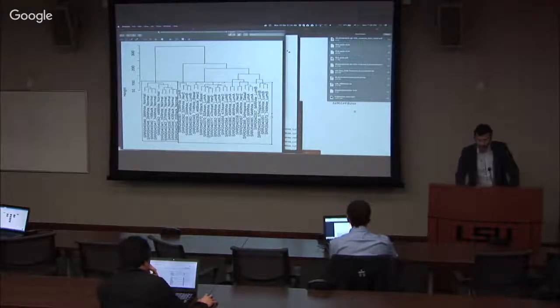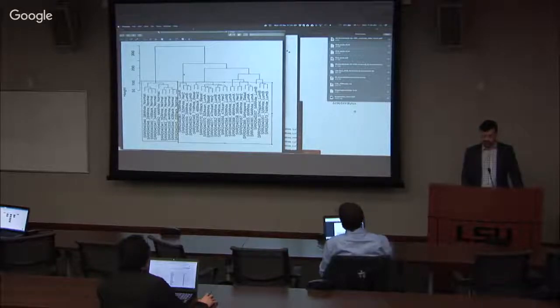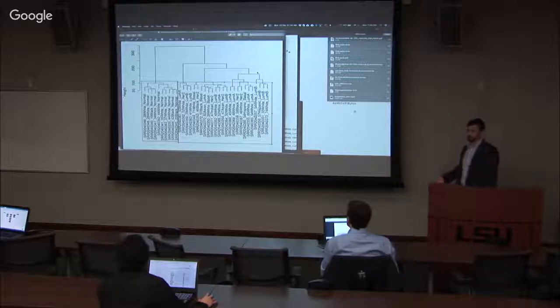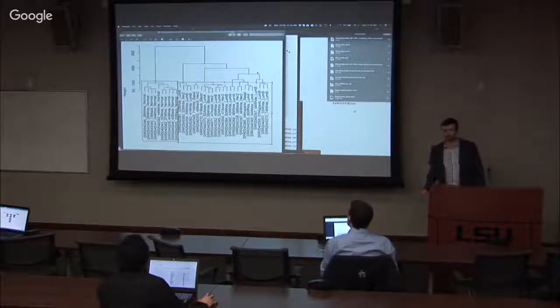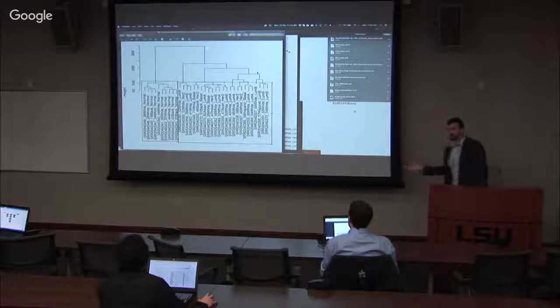But in reality, within all the rest, there's at least a number of other significant subclusters. And so if I forget about the number of clusters I told it that I expected, I can use this to also try and understand what should I be expecting. And that's why this particular method of clustering is useful as an exploration tool.